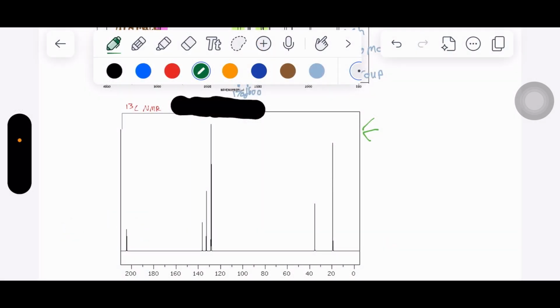Alright, so I'll be describing the carbon-13 NMR spectrum of the formula C10H12O. This contains several unique carbon environments, and we typically expect 6 or 7 distinct carbon signals in the 13C NMR spectrum due to the symmetry and the equivalent groups. So I'm going to break this down and elaborate on the carbon types and their chemical shifts.